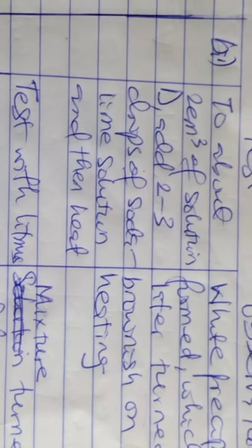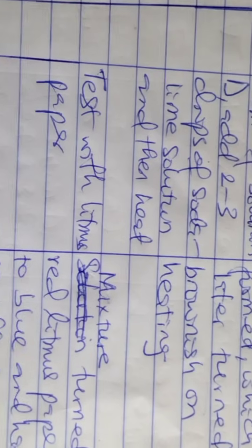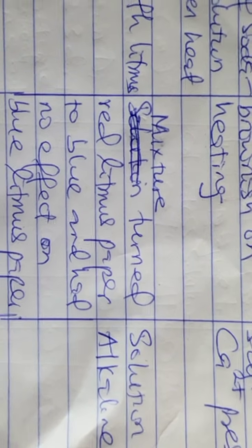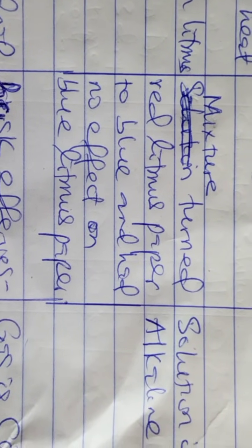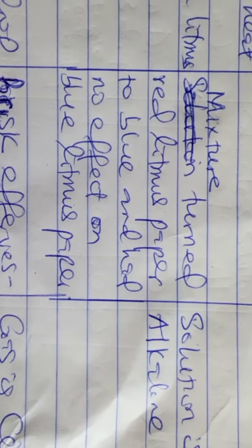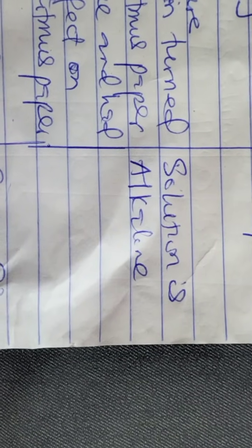Okay. Then under the test column, we also have test with litmus paper. You test the mixture with litmus paper. The inference should be mixture turned red litmus paper to blue and had no effect on blue litmus paper. So you now say mixture or solution is alkaline or basic.